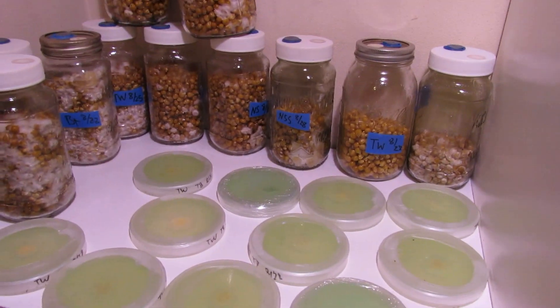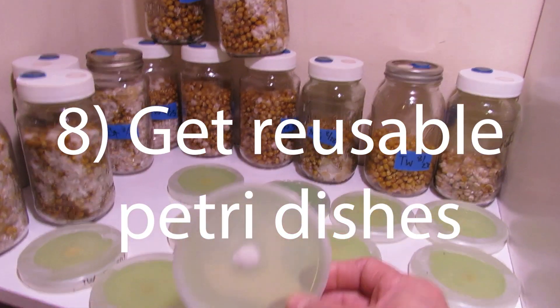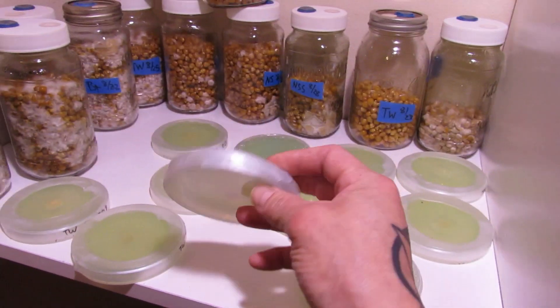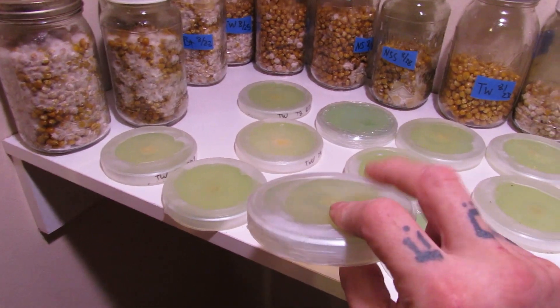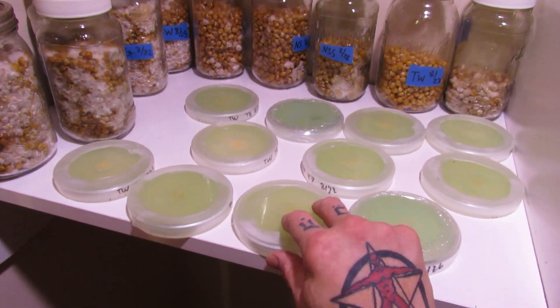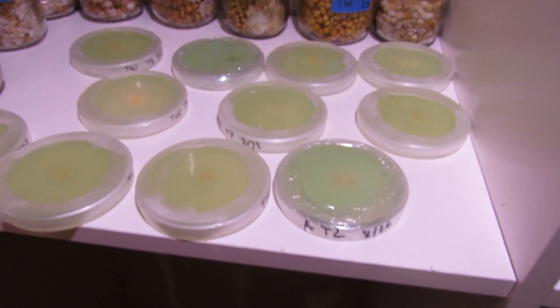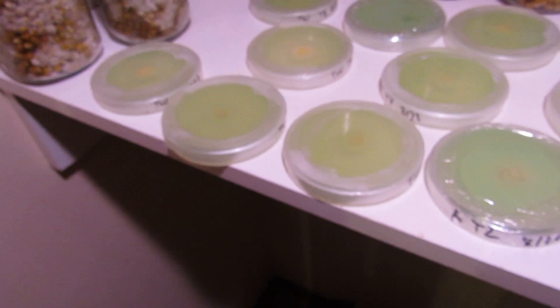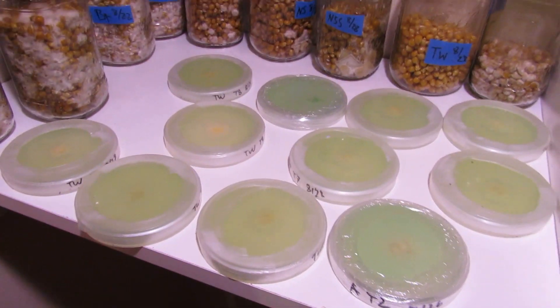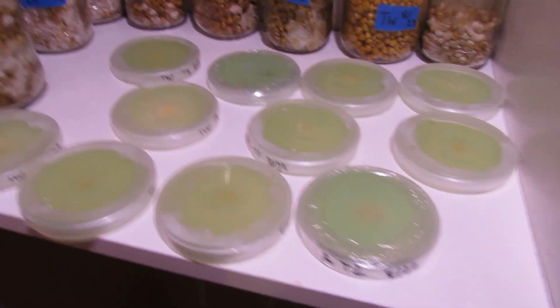Number eight: I recommend these reusable agar plates — I think it's called polypropylene or something like that. It's a type of plastic you can put in the autoclave and re-sterilize, as opposed to the cheap disposable ones. I've had a ton more success since I started working with petri dishes I can re-sterilize.